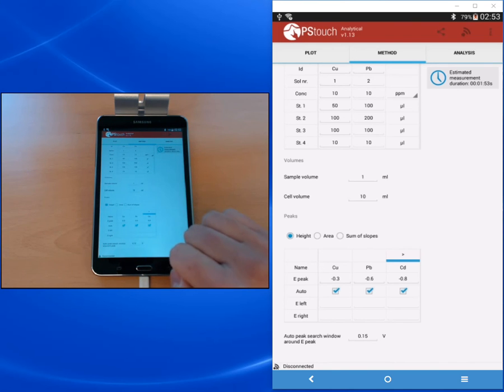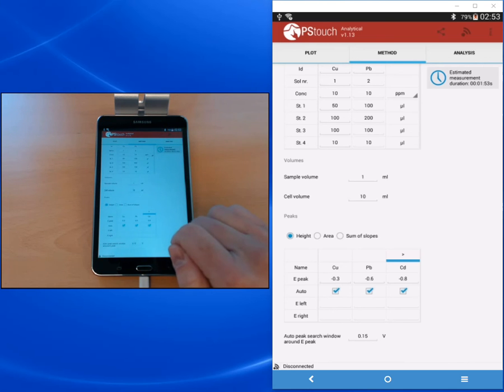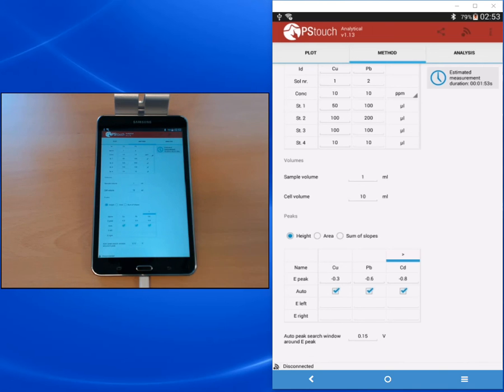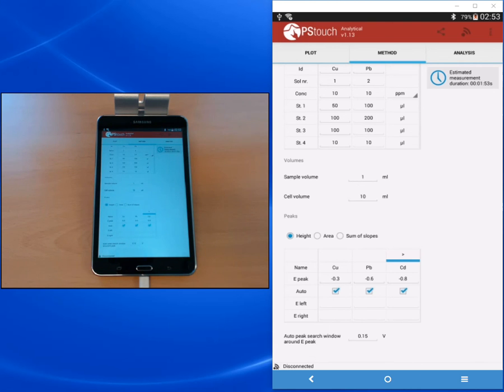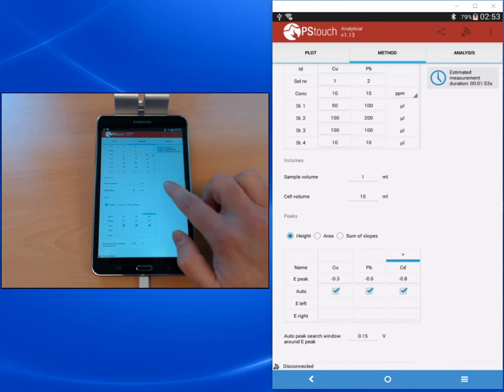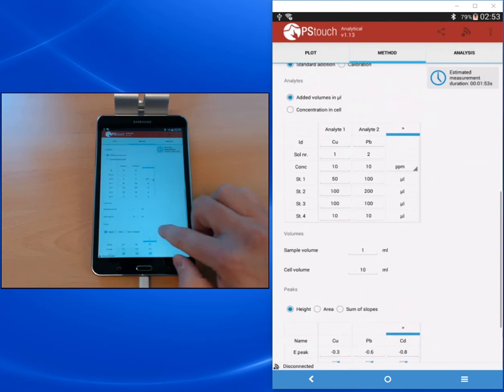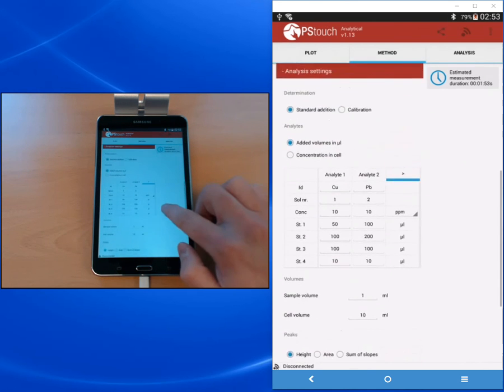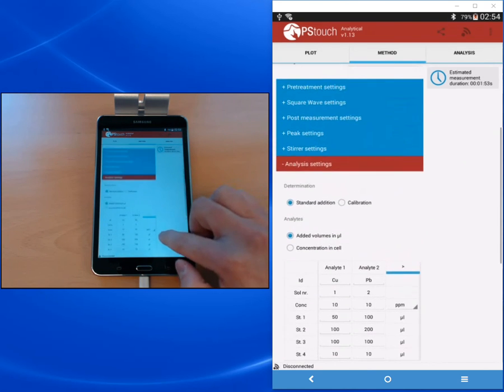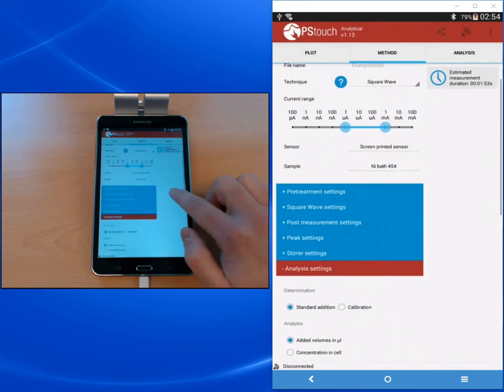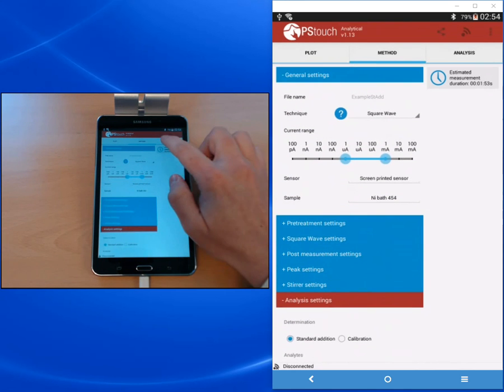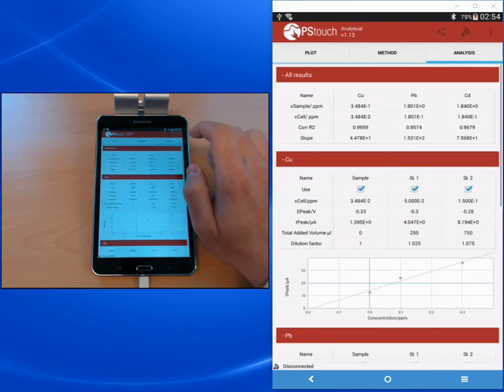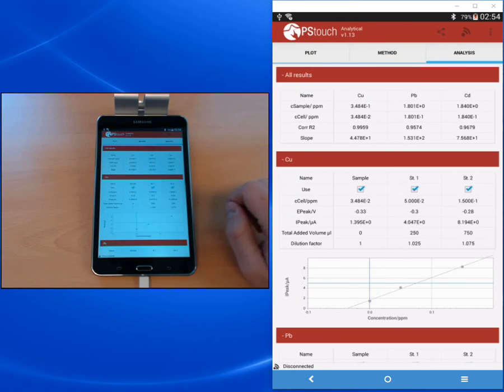You can also, if your peak is difficult to determine, choose not to make an auto search but to set fixed borders for your peak. You would then switch the checkbox off in the auto row and enter into e-left and e-right the values for the borders for the peak.